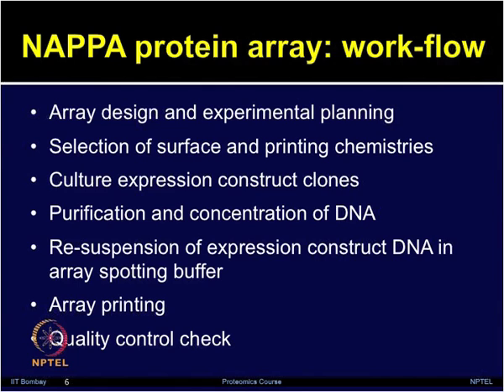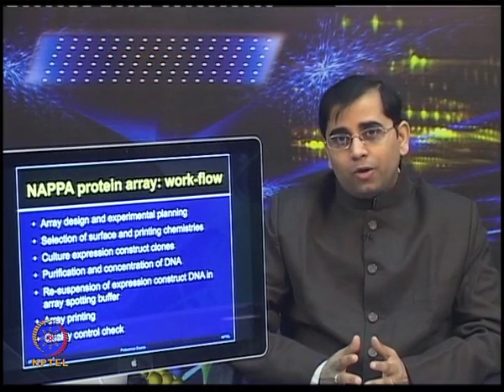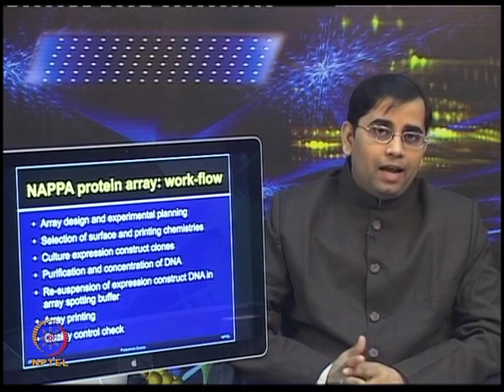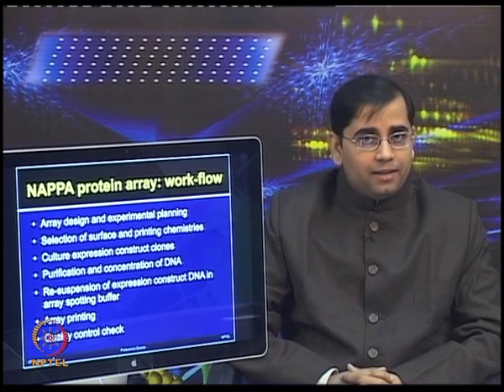If you have a specific objective in mind, say you want to study protein-protein interactions, you need to have some good positive controls for the protein interactors as well as some negative controls. If you want to identify some biomarkers, for example, you are looking for serum screening, you again need some good quality control spots such as human IgGs or mouse IgGs. So, a lot of thought process goes into designing the experiment for microarrays, as opposed to what one does in other types of proteomic techniques.